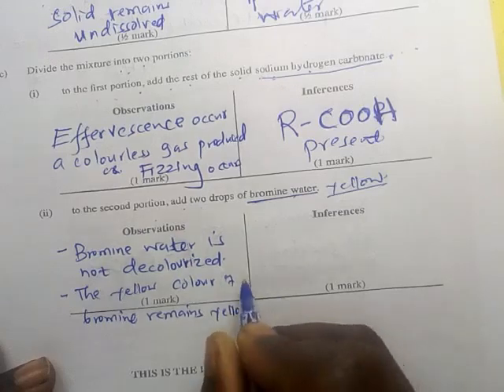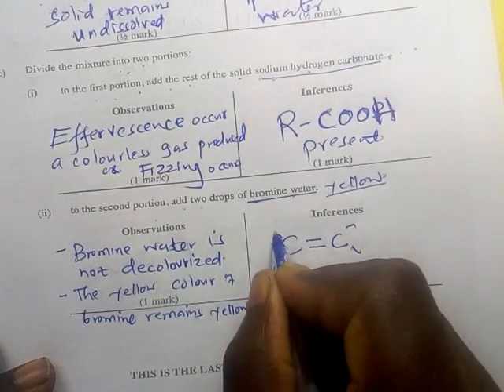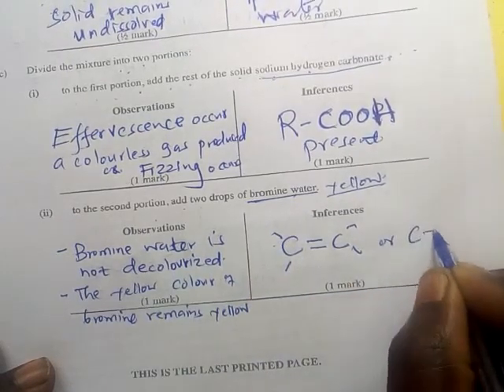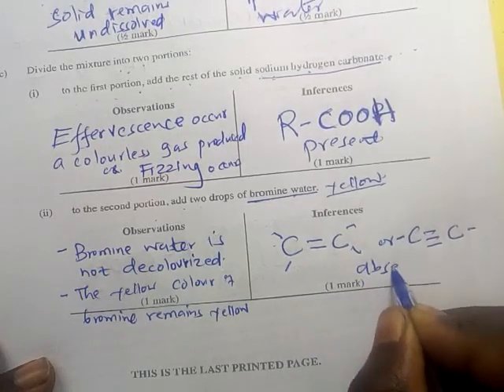The color is retained, so what it means is that the double bond or the triple bond is absent.